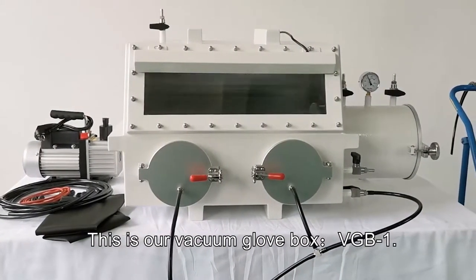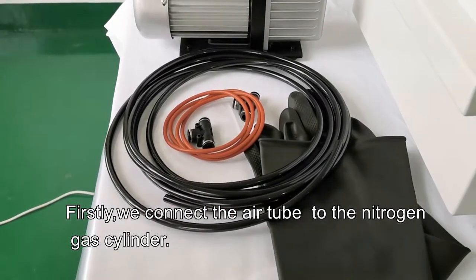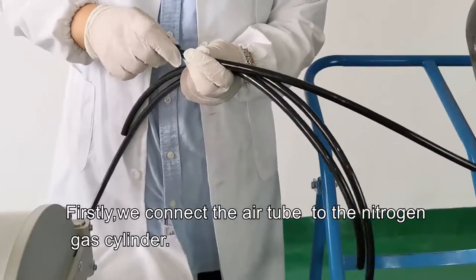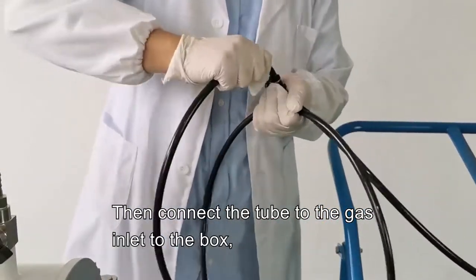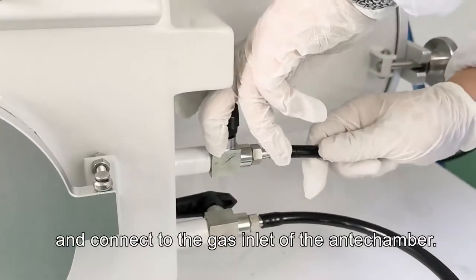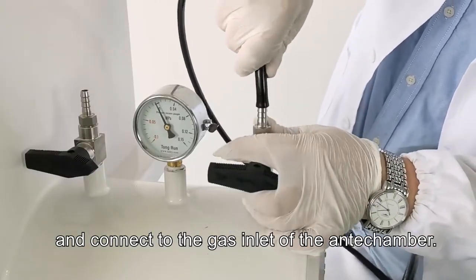This is our vacuum glove box VGB1. Firstly, we connect the air tube to the nitrogen gas cylinder. Then connect the tube to the gas inlet to the box and connect to the gas inlet of the anti-chamber.